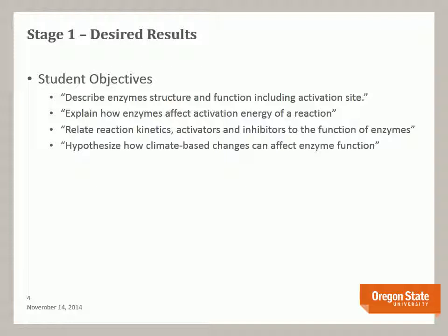Finally, the student objectives were included in the lab directions itself. So these are all direct quotes. Describe enzymes, structures, and functions, including activation site. Explain how enzymes affect activation energy of a reaction. Relate reaction kinetics, activators, and inhibitors to the function of enzymes. Hypothesize how climate-based changes can affect enzyme function.